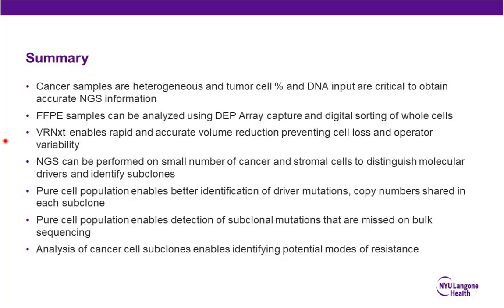Our strategy is to have at least a 5 to 10 cell pool. For example, you take the neurons that are the same size, from the same layer, so you can judge them by the size and shape. And then if you have a pool of at least 10 neurons, that actually works relatively well on RNA sequencing.